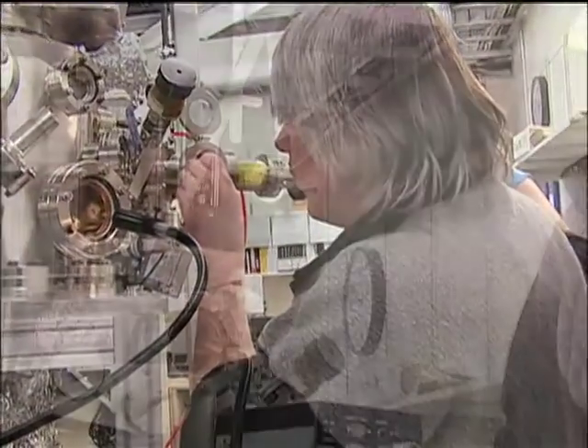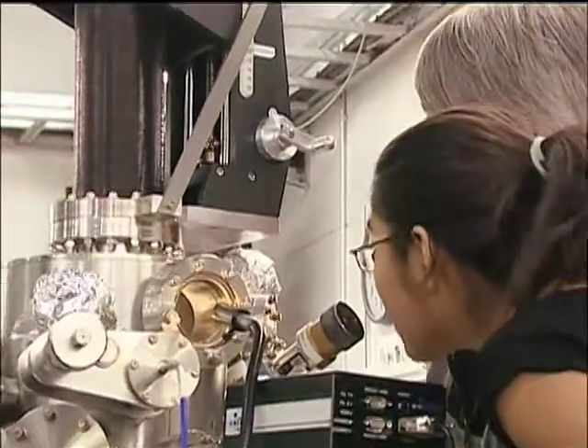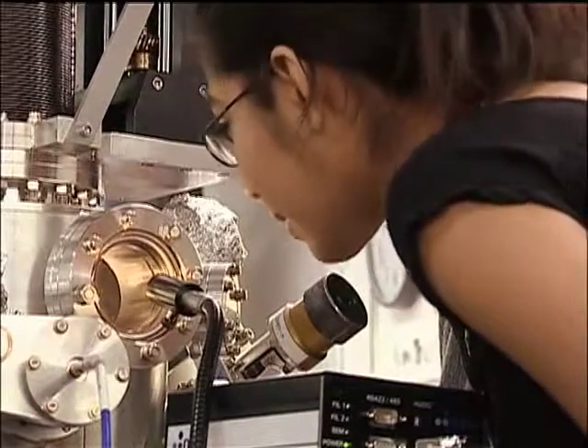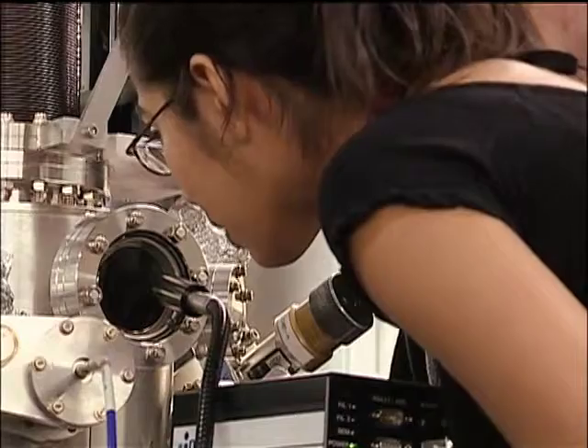Then the students get a chance to view their sample on the target pad. Put the light on so you can spot where the sample is. Tell me when you can see it. Yeah, I can see it. Ok, I'm going to turn it off. And you should eventually be able to see a little blue dot.